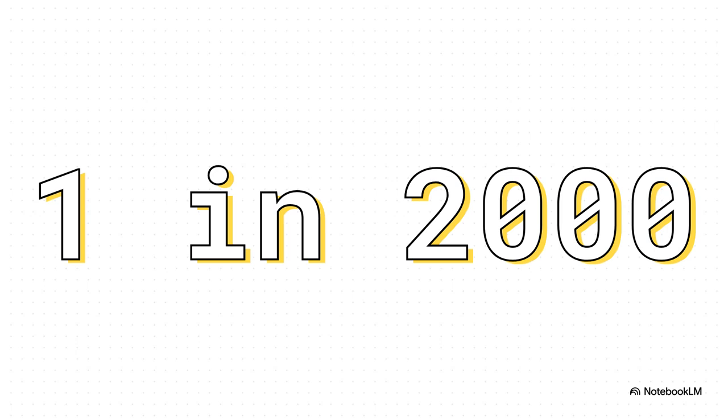First off, let's just take a second to appreciate how hard this was. Because of the way their microscope was built, they couldn't just grab any old crystal and tilt it however they wanted. Nope. They had to find one that was already sitting in almost the perfect starting position. And the odds of finding one like that just by chance? About 1 in 2,000. So this wasn't some quick and easy thing. They had to patiently hunt and hunt and hunt for the perfect specimen.